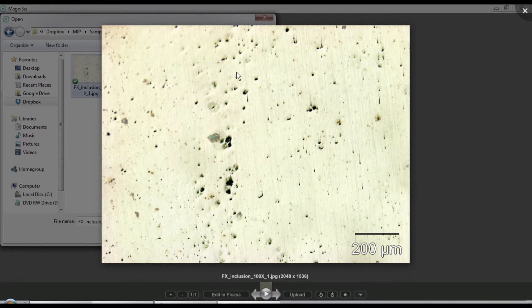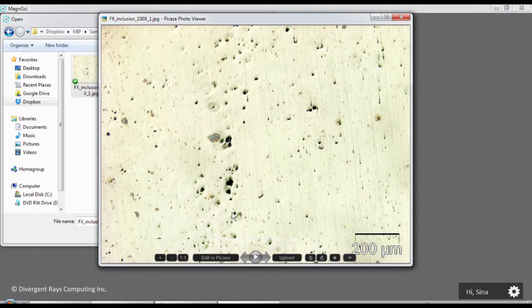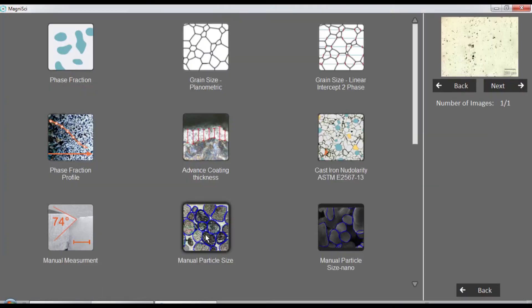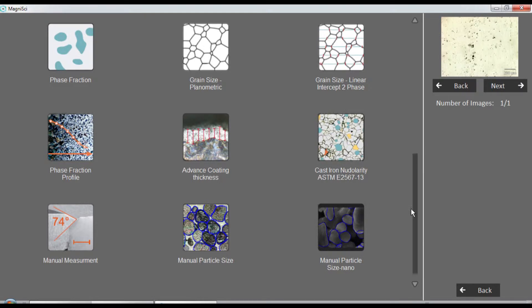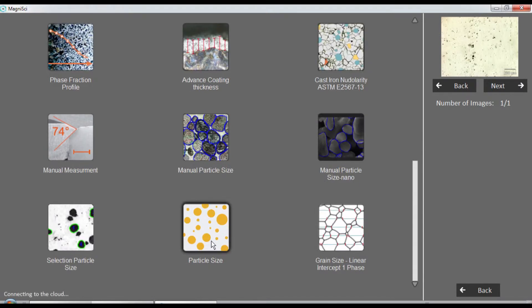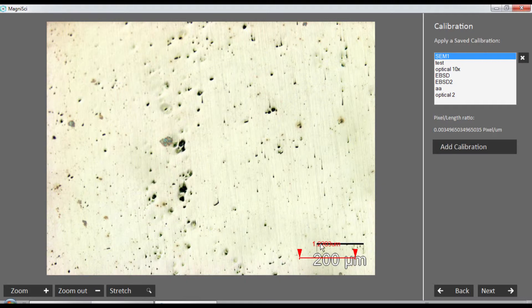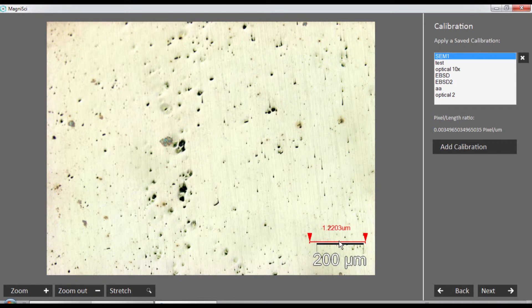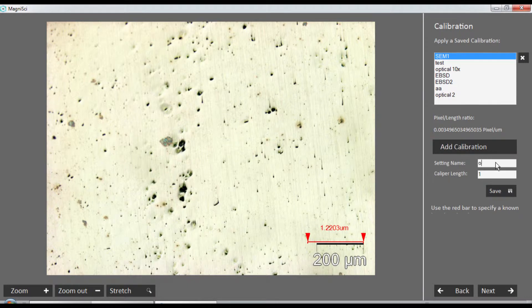I would like to open this image inside the software and then choose the particle size app to do the measurement. First we have to calibrate it. We don't necessarily want the calibration bar to be in the image - we can calibrate with another image and come back and use that calibration. I call this optical 500x and then specify the length of it.